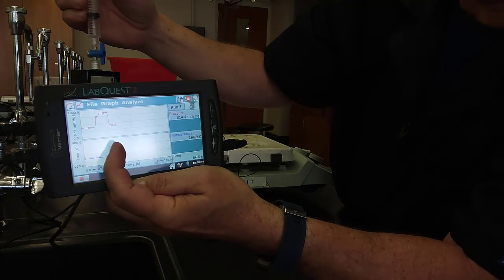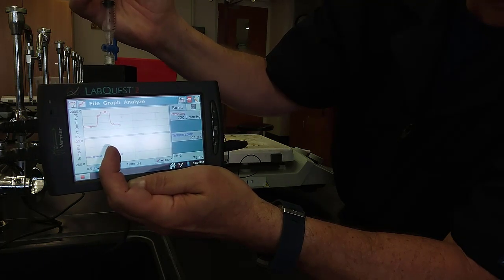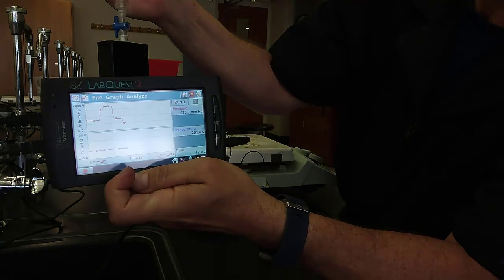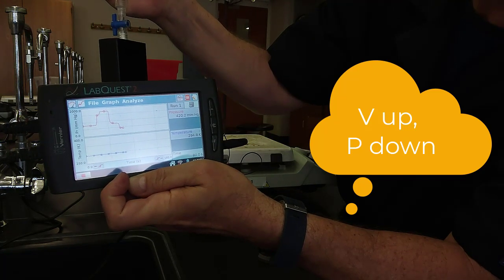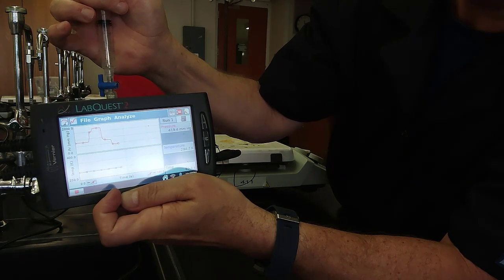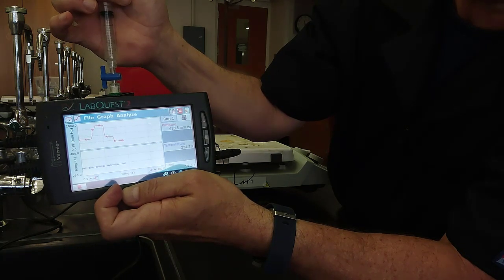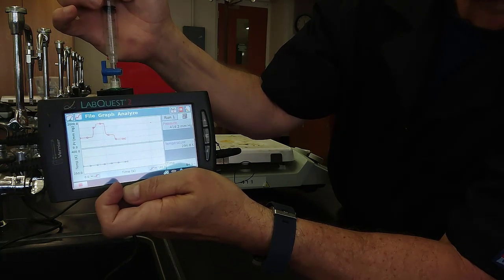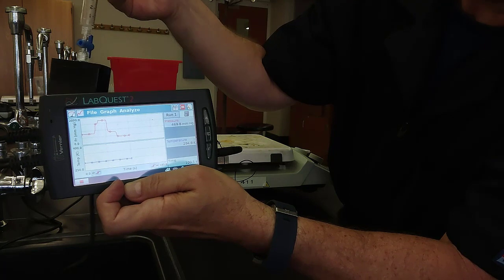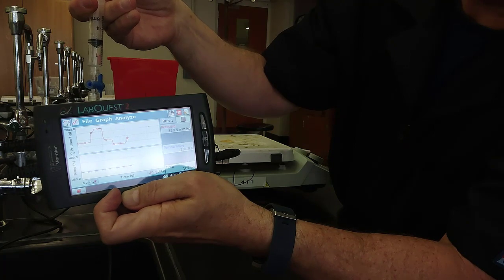Now, so long as I don't have any leaks, I'm going to try and expand this from 2.5 milliliters to 5 milliliters. And look at that. The pressure dropped. When my volume got bigger, my pressure got smaller. So we seem to have what is known as an inverse relationship between pressure and volume. The pressure went down when my volume went up, and my pressure went up when my volume went down.